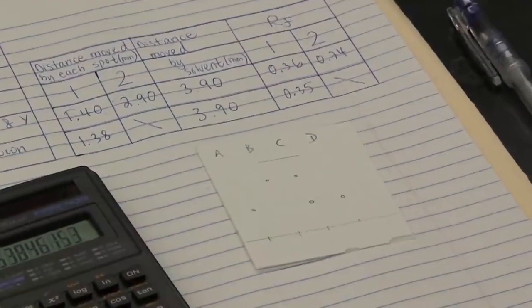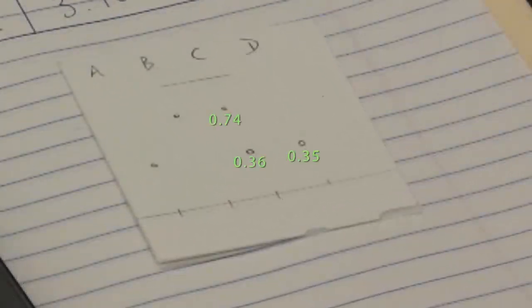Here we can see that the RF of the spot in lane D is much closer to the RF of compound X than the RF of compound Y, and since we knew that the unknown was one or the other, we can confirm the unknown's identity as being compound X.